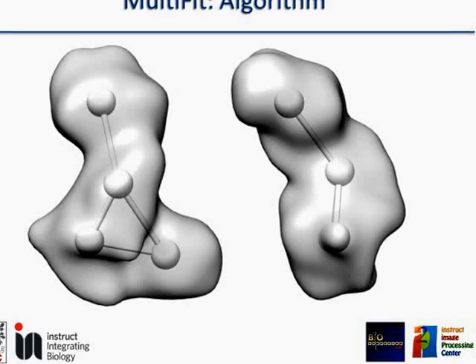These nodes are there because I told MultiFit to fit 4 structures. So for MultiFit, it's quite important to know the exact number of structures in our complex. Let's say that the program is not developed to perform partial fitting. So if instead of 4 I choose 3 structures, I will have a 3-node graph.